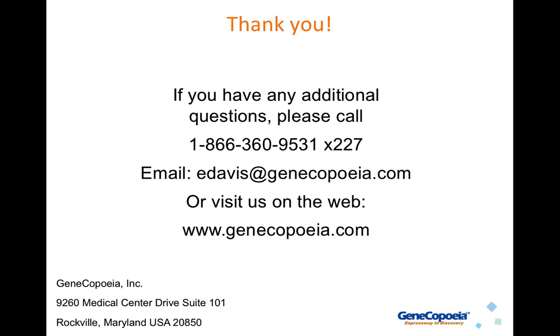What is the best way to evaluate any off-target effects? Well, that's a good question. I didn't talk about that, but the best way to check for off-target modification is to do next-generation sequencing on your edited clones. Alternatively, you could use software prediction to predict off-target sites and then check to see if those are modified, but NGS is unbiased, unlike checking predicted sites. So it's really a matter of choice.